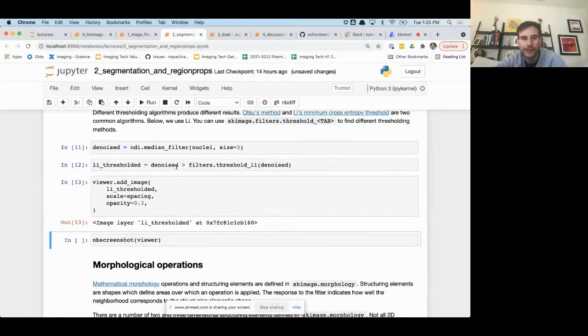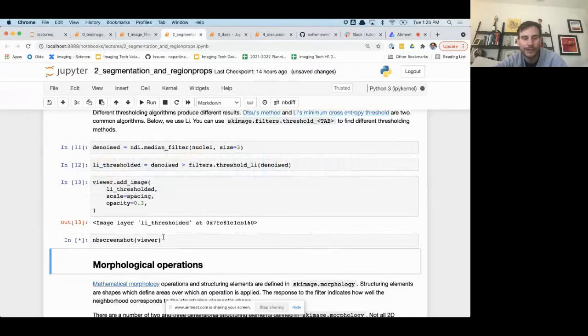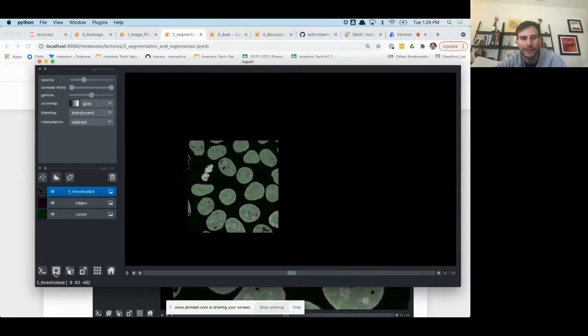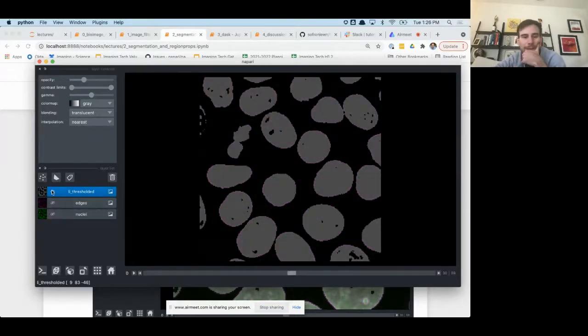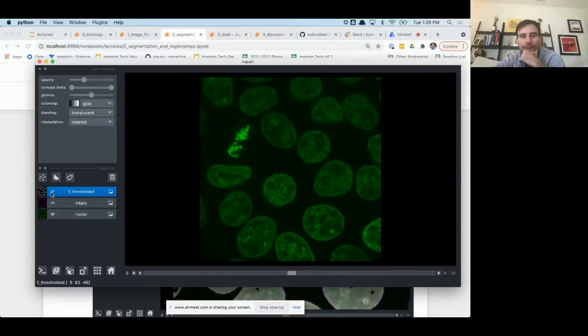If we add the threshold to the viewer, we can run the screenshot again. Some folks will see it, but let's go back. You can see it's used wherever I was last to take that screenshot. This was our image.